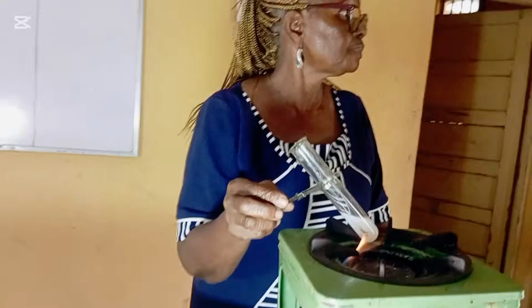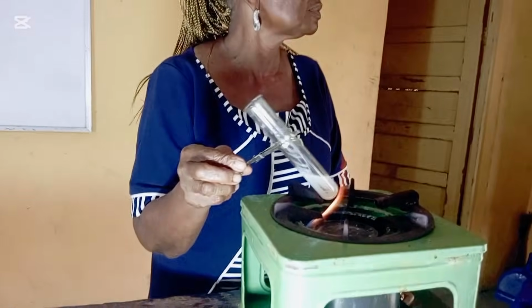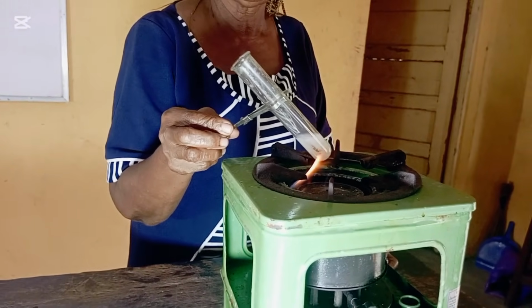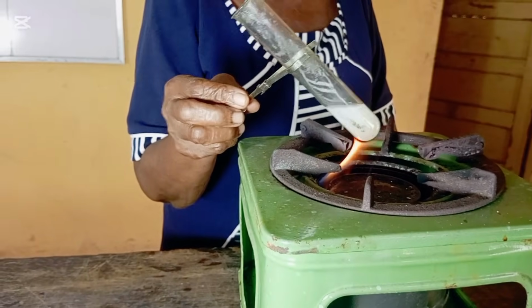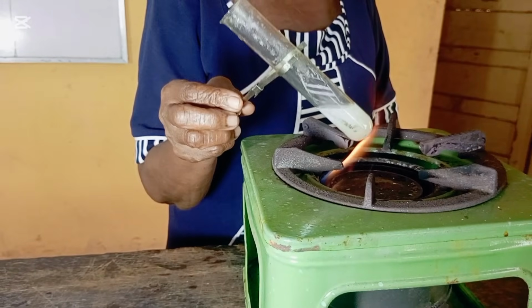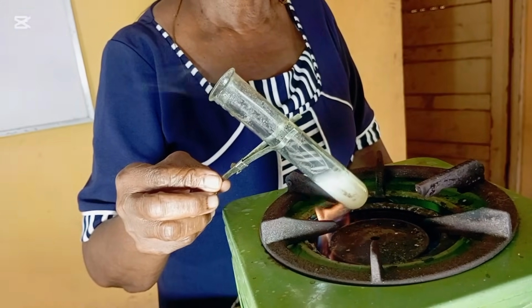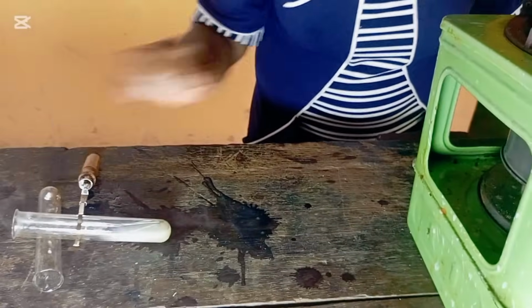I'm heating. The heating is supposed to make the white PPT dissolve. Even the HCl is supposed to dissolve it. I believe that the heating will now help to increase the rate of the reaction, because increase in temperature increases the rate of reaction. Okay, I will not waste much of your time. Let me go ahead and give you the reports.